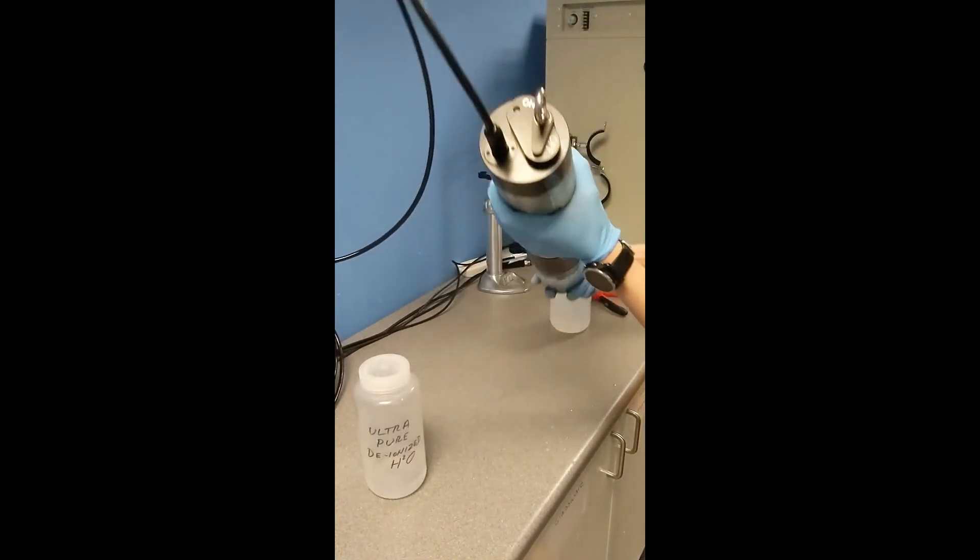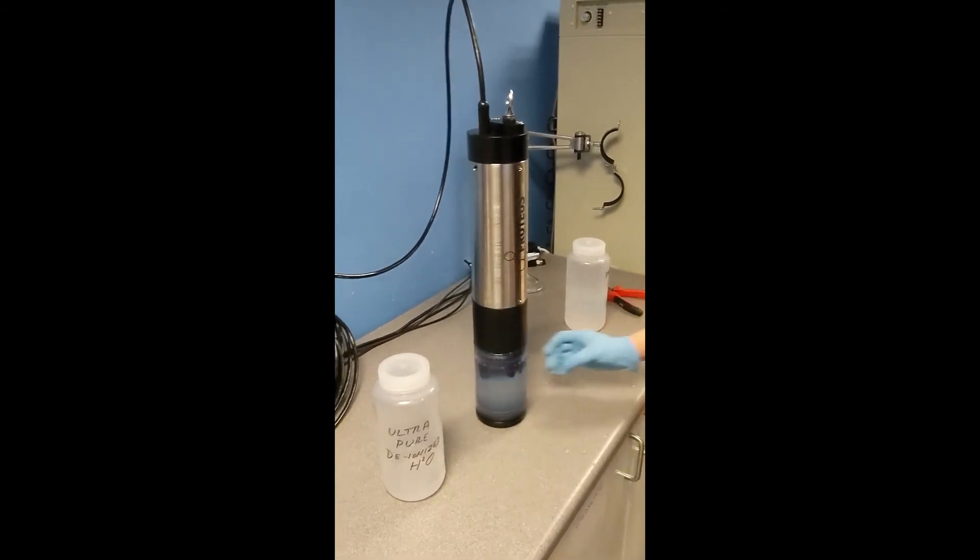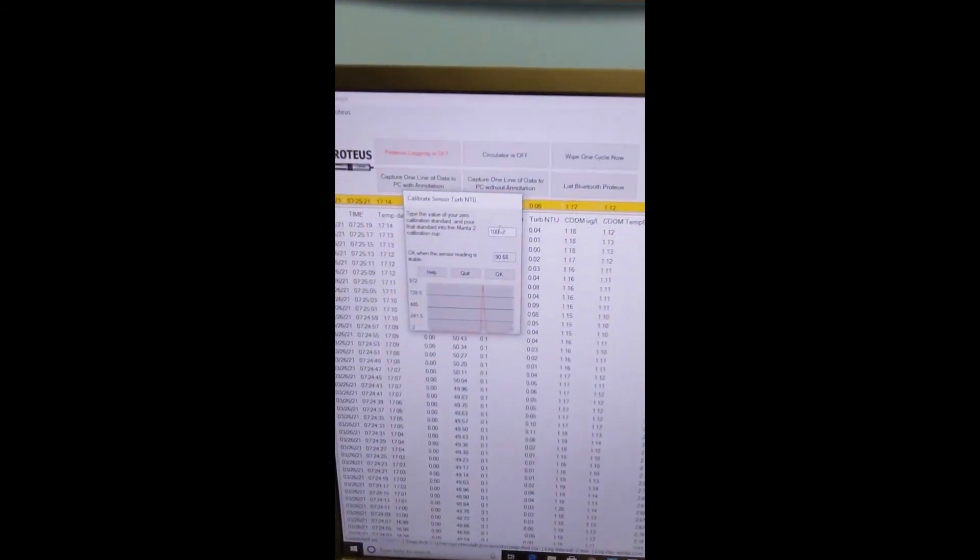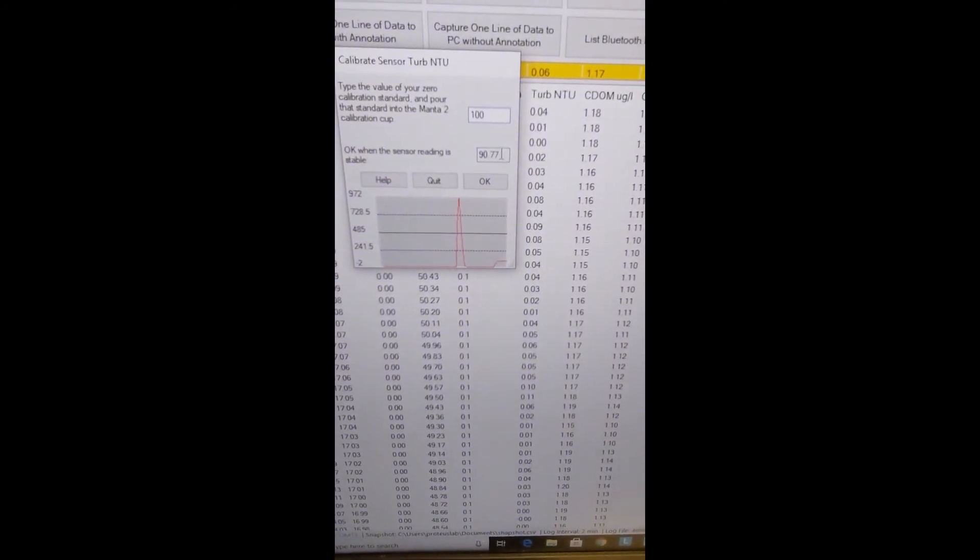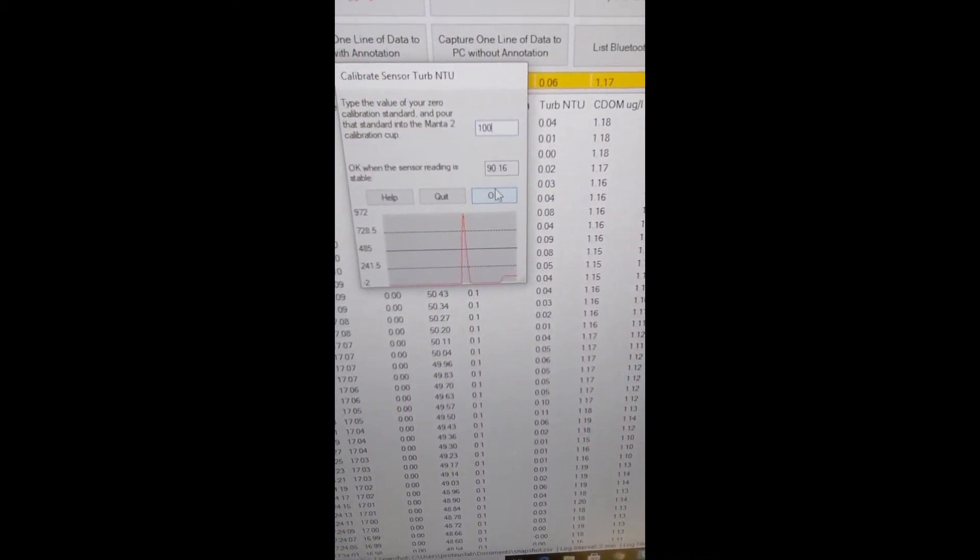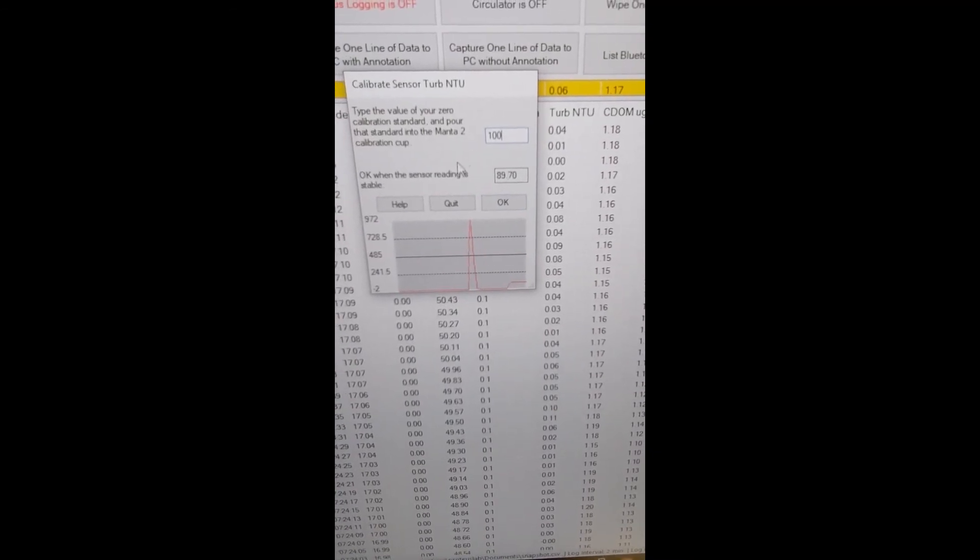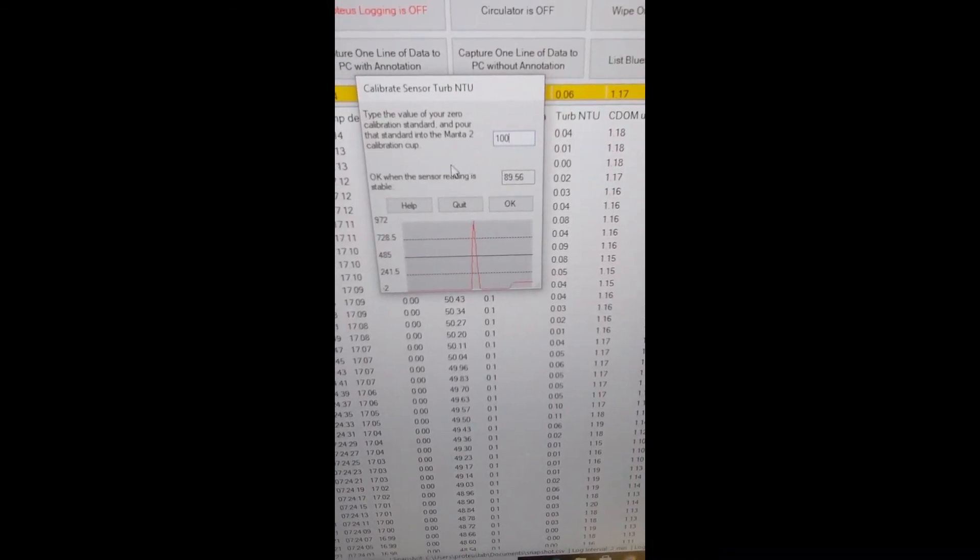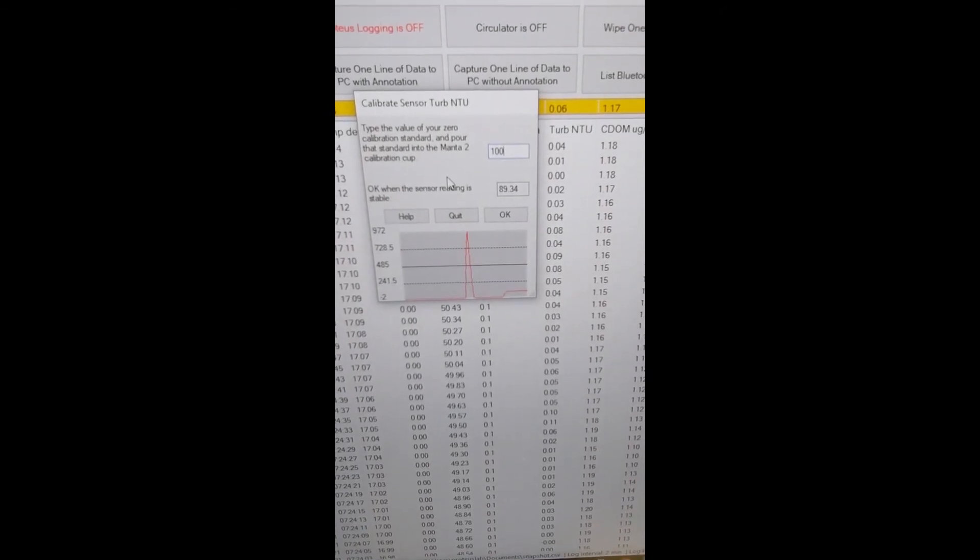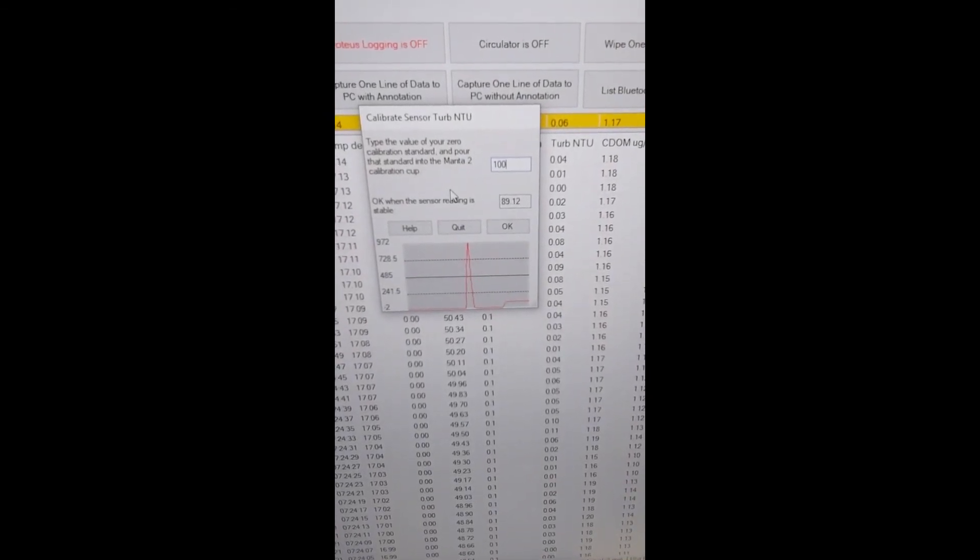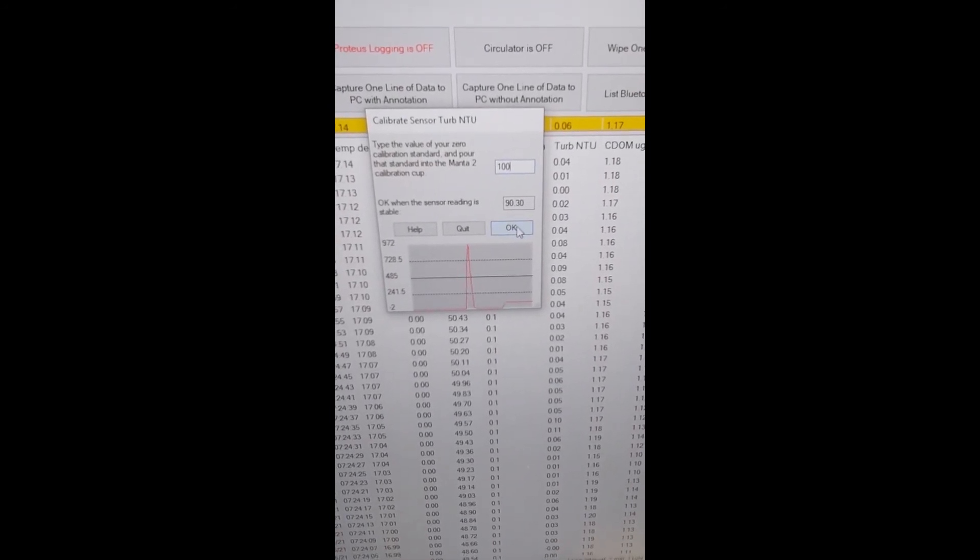There we go, and we go back to the software. Now as you can see, it's reading 90.77, it's fairly stable. It's starting to settle out just a little bit, so what I'm going to do quickly is just invert it one more time. You'll see the reading rise again, and we're just going to OK that.